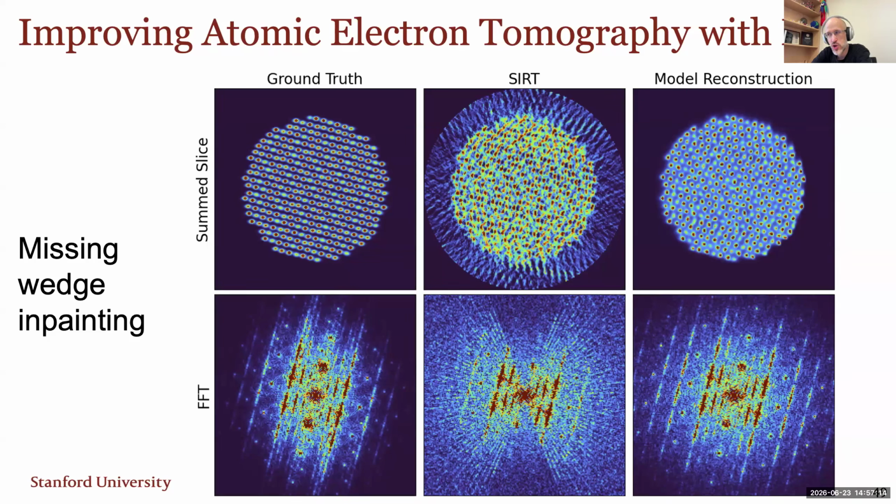But I would say for imaging, convolutional networks are the state of the art. And for tomography or sharp diffraction spots or things like that, K-plane tensor train decomposition is the state of the art. But that's my opinion. You'll find lots of different opinions in the field here.